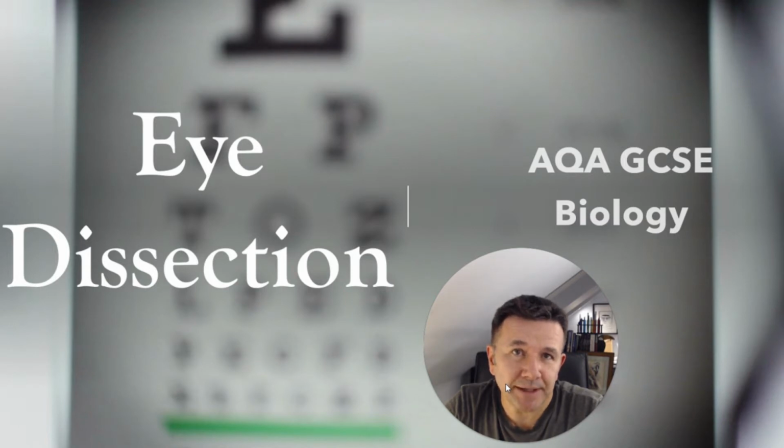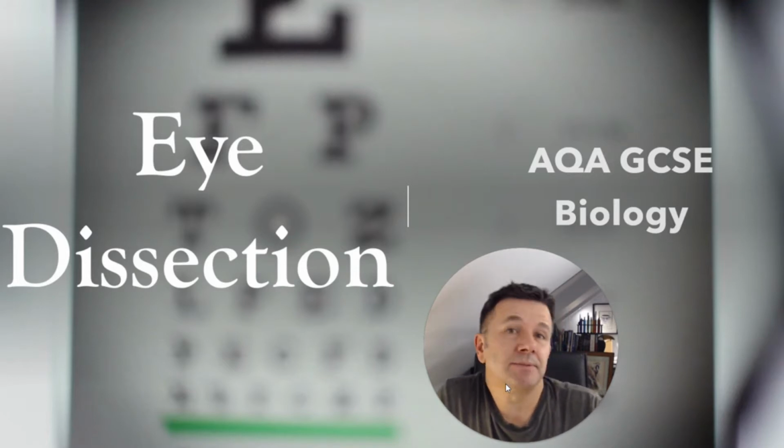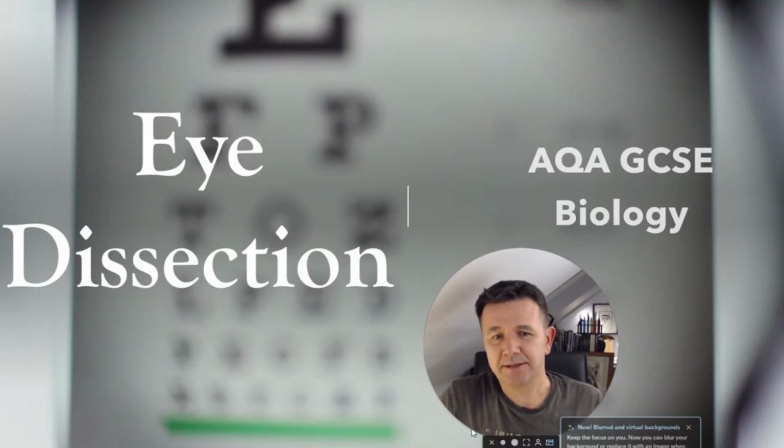Just to warn you, it does feature a sheep's eye, and if you're not into looking at real tissue, then probably not the video for you. This is going to be the start of a series of videos all about the eye, so let's get started.